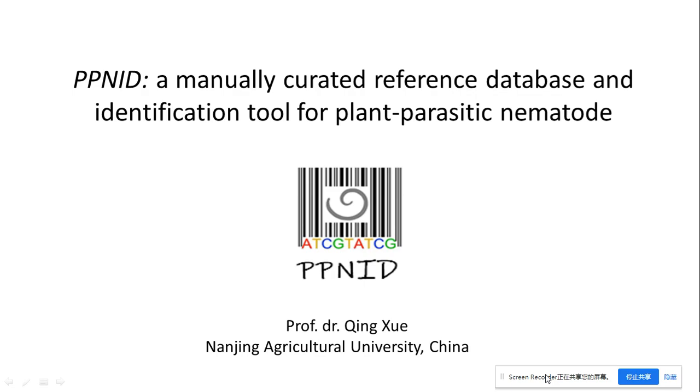Hello, I'm Qing. Today I'm going to give an introduction about PPNID, which is a program that I developed for identification of plant-parasitic nematodes.